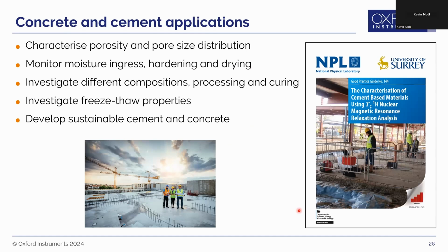Now, a round-robin study was carried out and a report published by the University of Surrey and the UK National Physical Laboratory on the use of T2 relaxometry to characterize the pore size distribution in cement-based materials. As far as I'm aware, this was the first published study of its kind comparing the performance of various TDNMR instruments, which also gave recommendations on making consistent T2 measurements on these types of materials.